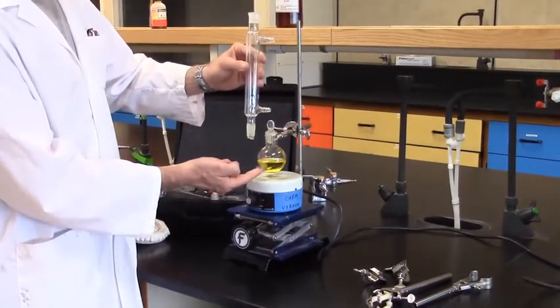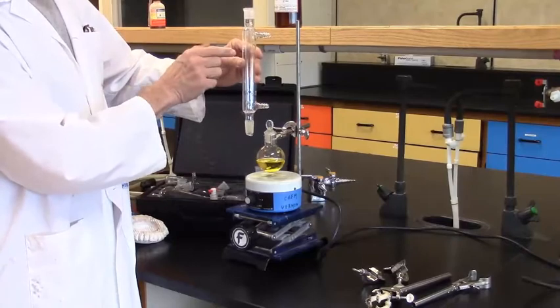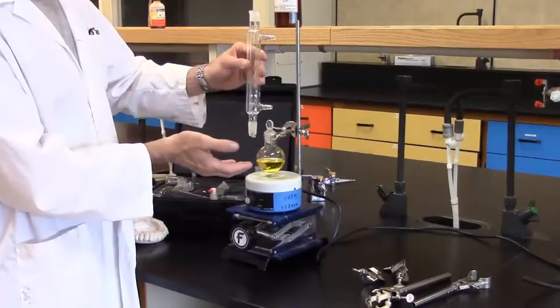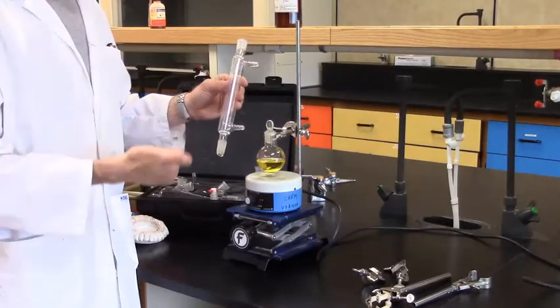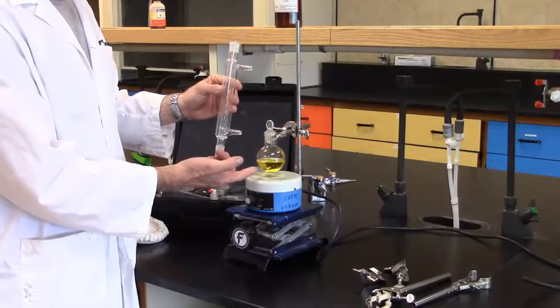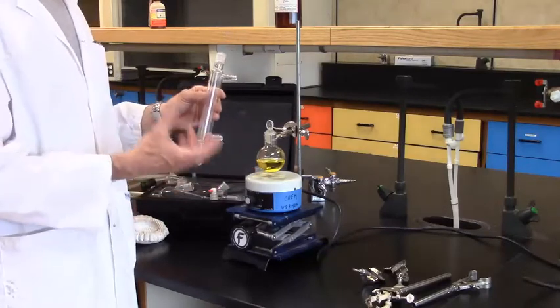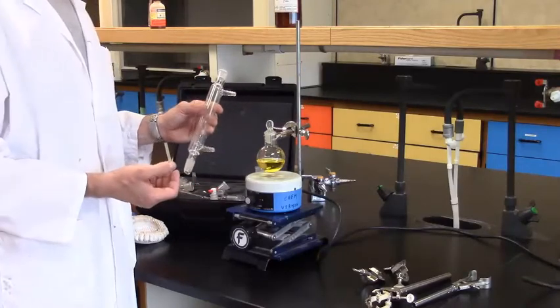And as vapor boils, when we heat, they hit the cold water, or the cold jacket, condense, and return back to the flask. It does two nice things. Three nice things. It keeps the smell down. It maintains the level of the solvent in the container, as well as it maintains the reaction at exactly the boiling point of the solvent. So, this will be diethyl ether.